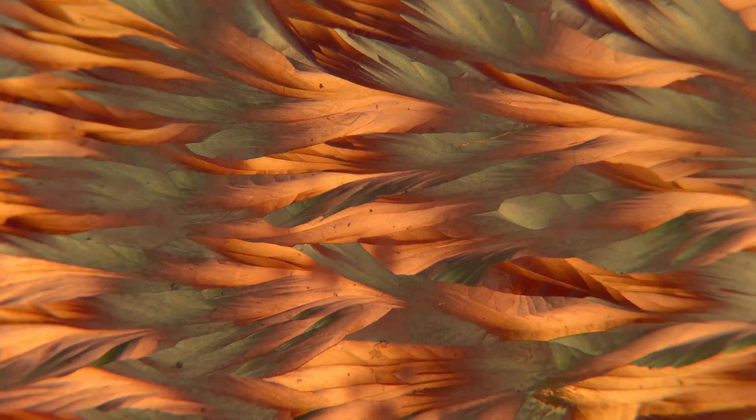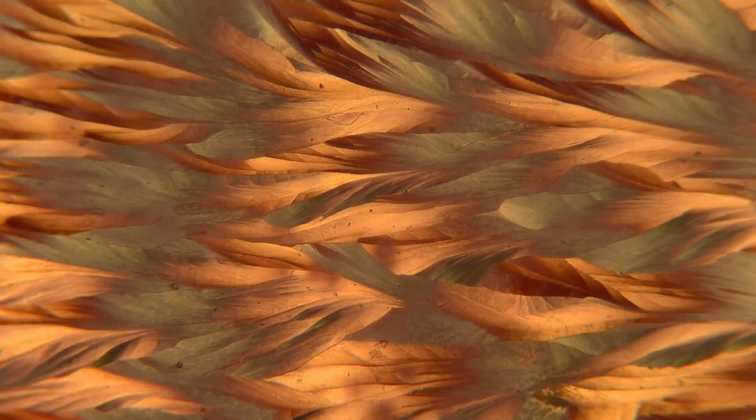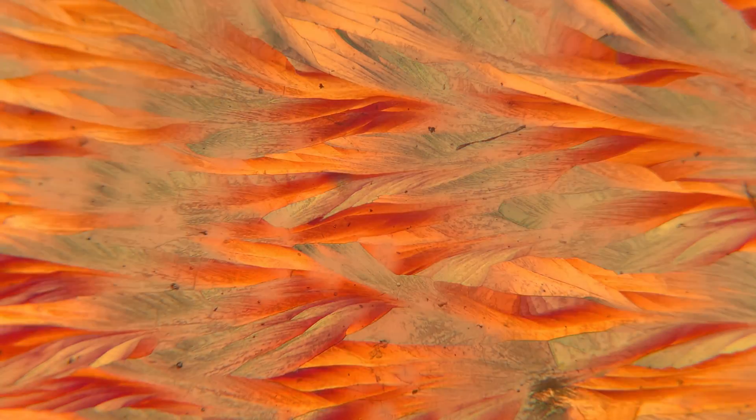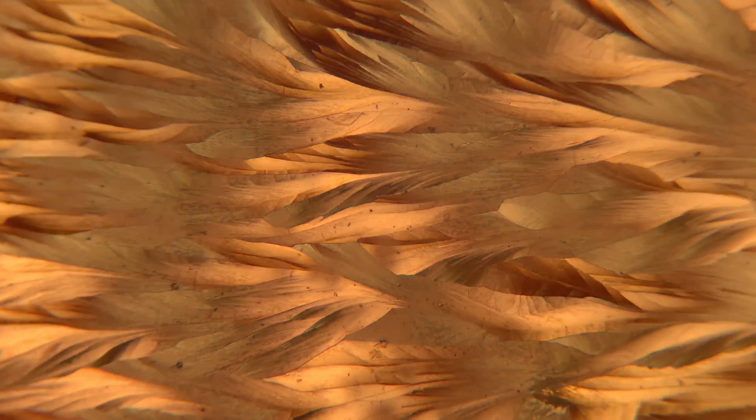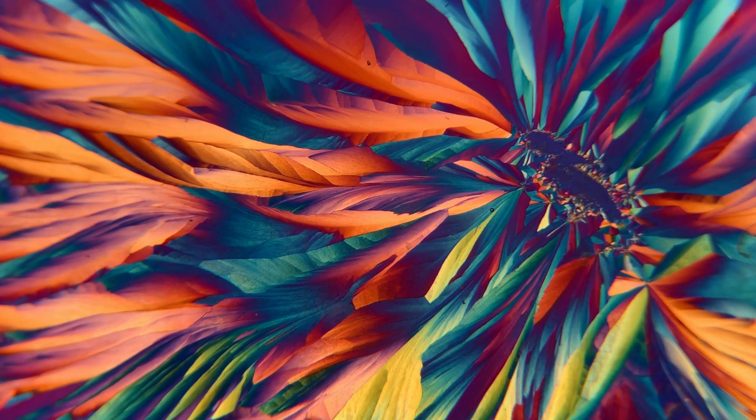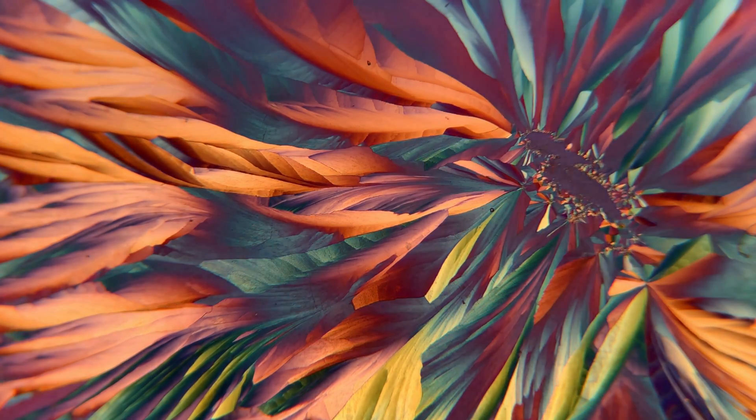So when we shine a white polarized light through the birefringent crystals, the individual light waves will interact differently with the crystals, altering the waves a bit in respect to each other. And depending on the thickness and orientation of the crystals, we get a change in color.